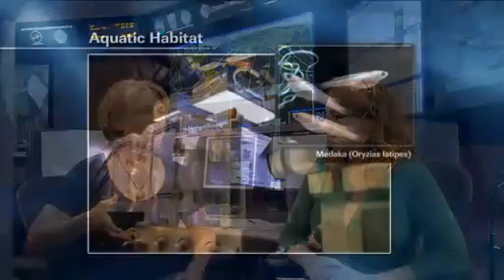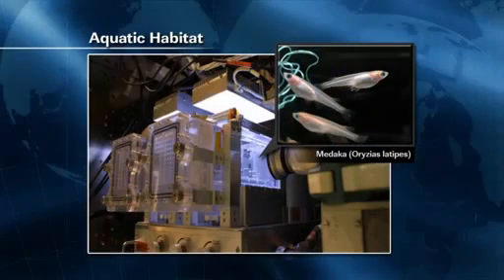These fish will go up in a small round container with membranes that allow exchange of air for the fish, loaded with water, and then launched up on a Soyuz, and then automatically inserted into the habitat. When this piece of hardware gets inserted into the habitat, it will release the fish and fill the aquarium.